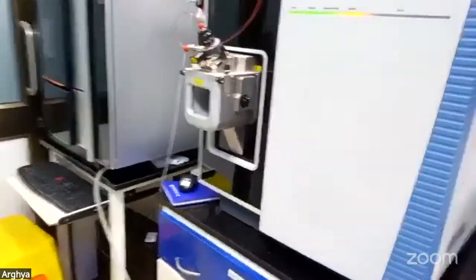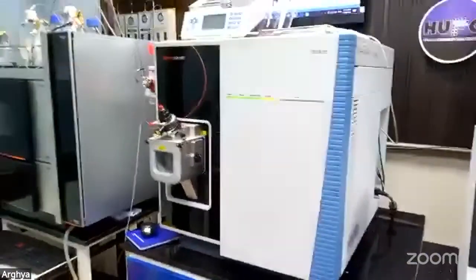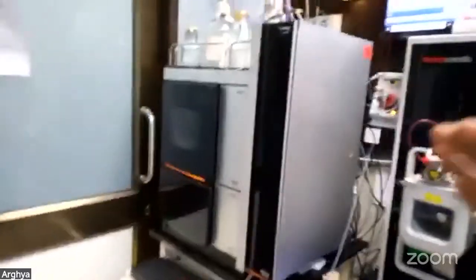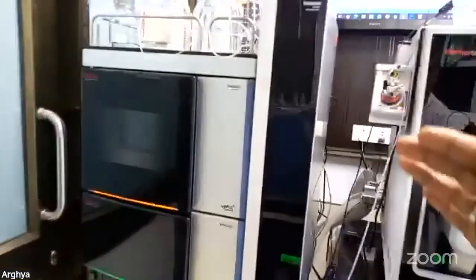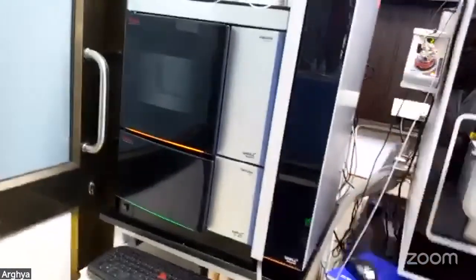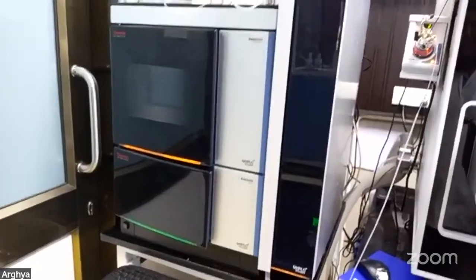Another mass spec which is used very routinely and frequently in the biopharma sector is the triple quadrupole. This is a triple quadrupole TSQ Altis that we have. Along with that we have a Vanquish HPLC, which is also one of the cutting edge UHPLC plus systems.